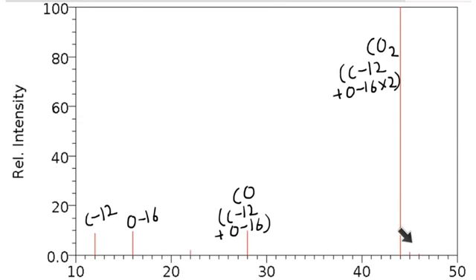We've also got a couple of little heavier peaks, so we can explain those by saying that it's CO2 with a molar mass of 45 or a molar mass of 46, so maybe there's oxygen 17 or maybe there's a carbon 13, something like that. That's a little bit weird because we don't see any here, but maybe there are just sensitivity problems or I don't know what.